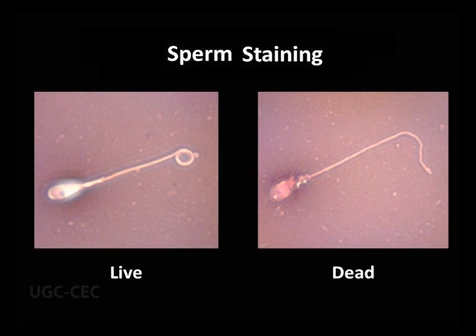Preparing slides for a basic morphology examination using nigrosin eosin stain. Many different staining techniques have been devised for examining sperm morphology. A nigrosin eosin stain is commonly used because it is effective, simple, and in addition to allowing sperm to be readily visualized, it is a so-called live dead stain, allowing one to assess membrane integrity at the same time as morphology. The technique for preparing an eosin nigrosin stain slide is as follows.